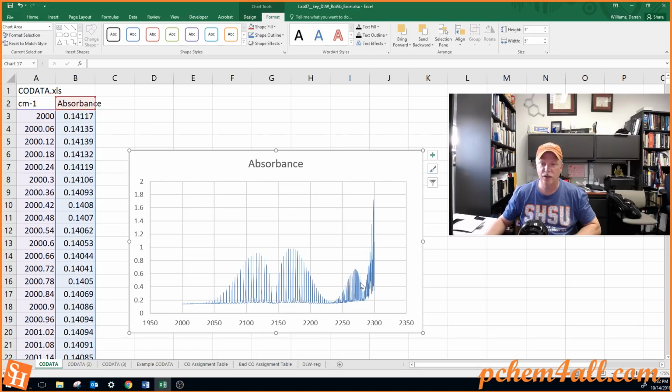We get over to this area, we actually see CO2. It starts to take off towards CO2 spectra, and then we get in here, and this is another isotope of CO2, so you might want to ask yourself, what would this signal be? But these two P and R branches are the carbon monoxide data that we're going to be analyzing. And so you'll need to peak pick these.